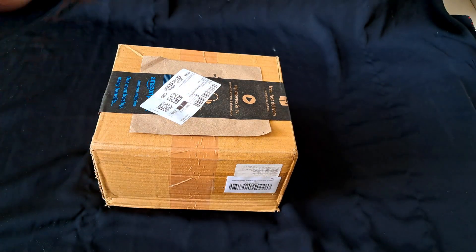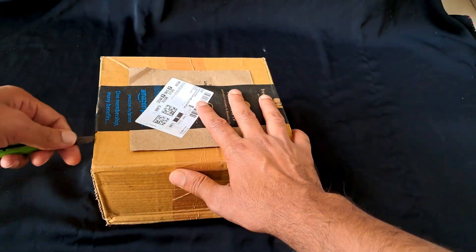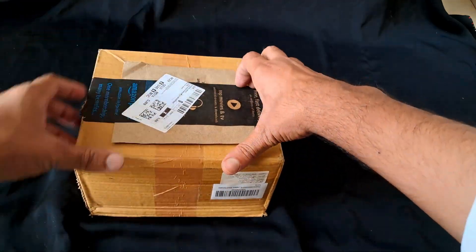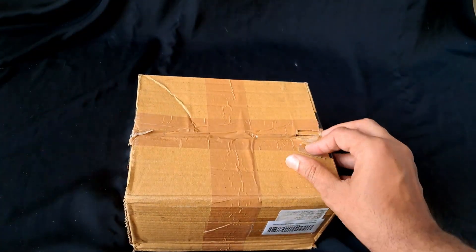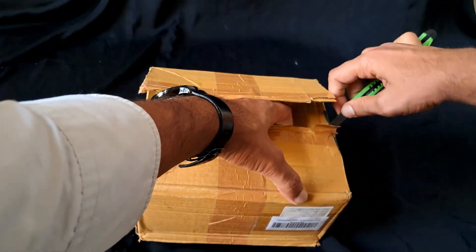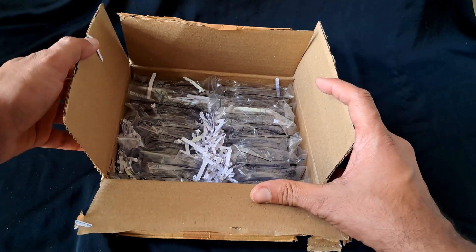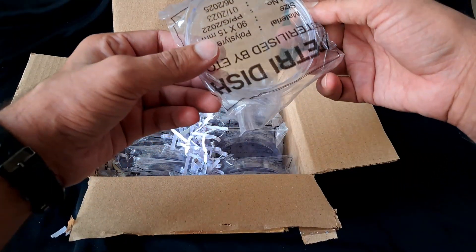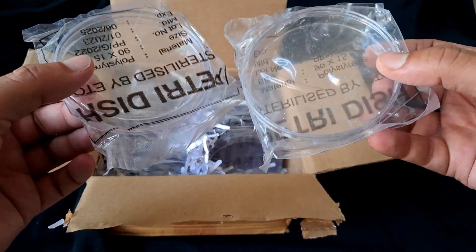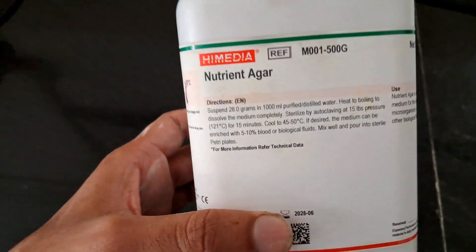Within a few days I received the order. Let's open it and see. It contains 20 petri dishes total. As soon as I saw them, I realized it was a waste of money — they don't contain any agar layer.